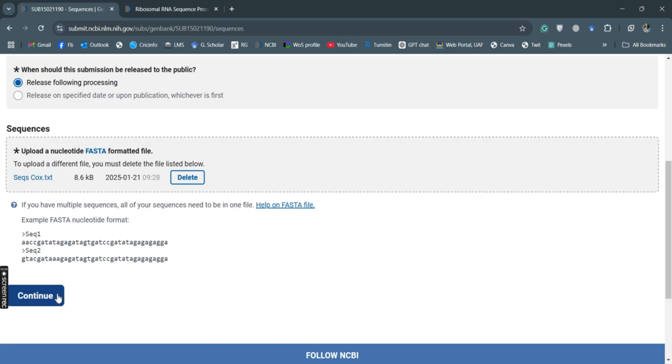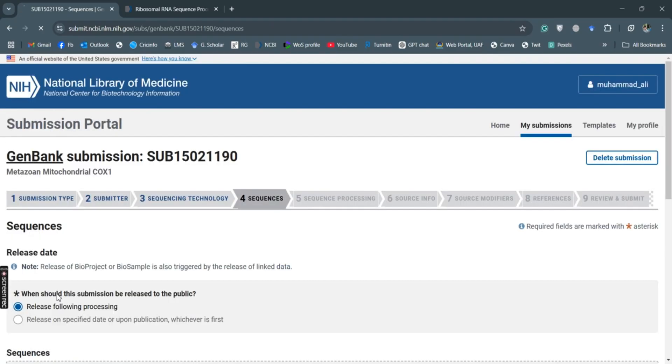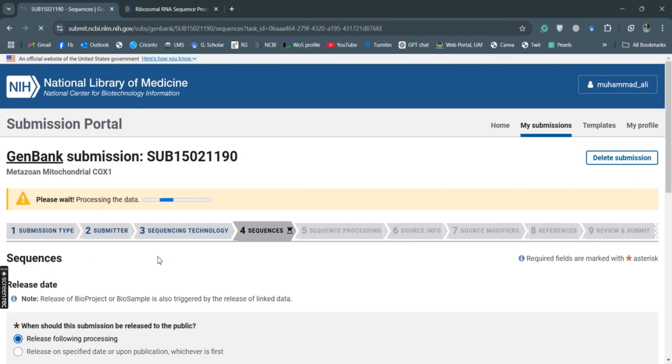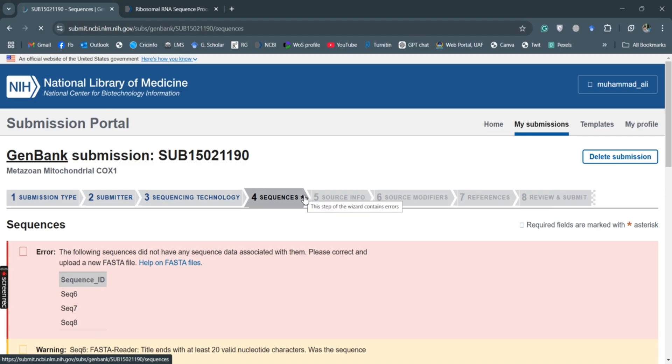So I will continue it and this will process the sequences. Processing is started.